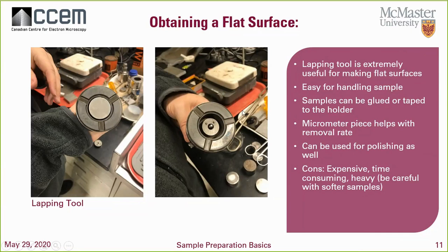And then as you're finishing off, you take it off, clean it, and then mount it in the appropriate holder for the application, SEM, or if you're going to do TEM. This tool is what I use to thin down aluminum for the TEM technique that I'll be showing later, and then punch the sample into 3mm discs and place them on the appropriate holder for the TEM.